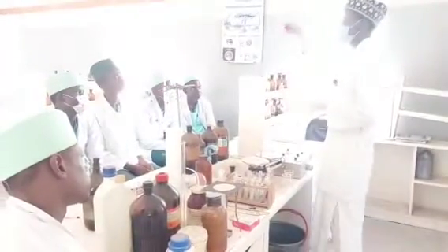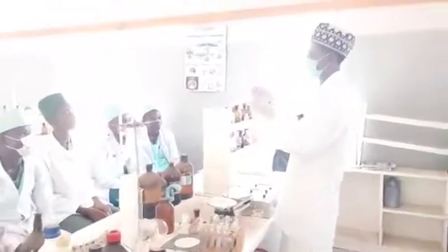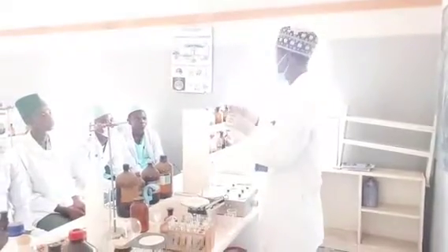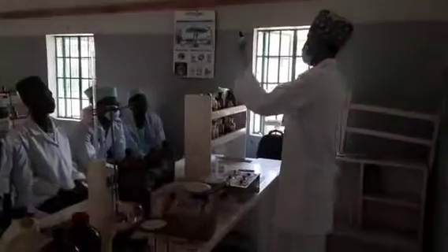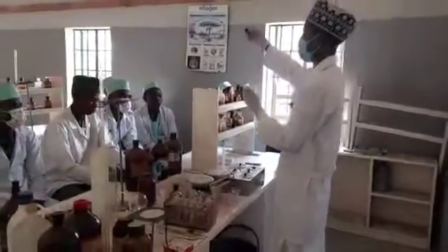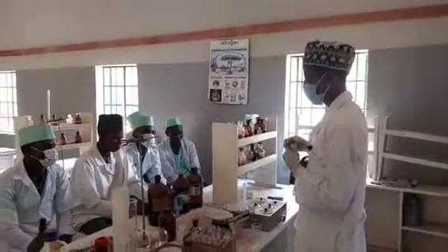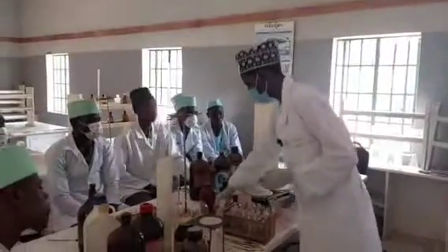This is our indicator bottle. It's just a container. This is the dropper. We have a rubber one. It's just a container like this, and this is the dropper. So I think with this introduction, you'll be able to identify them.